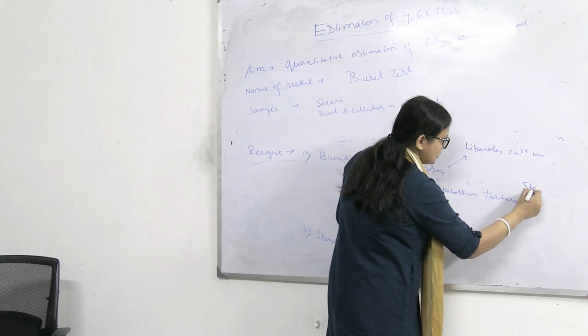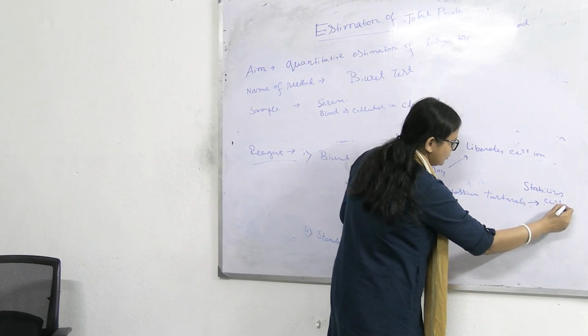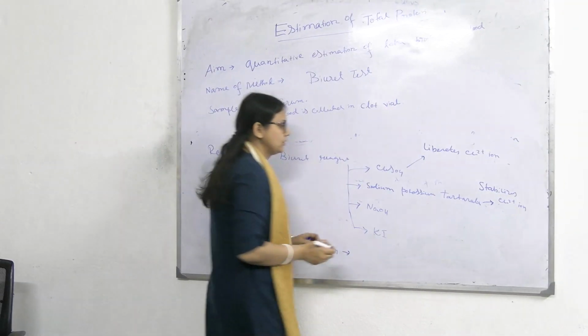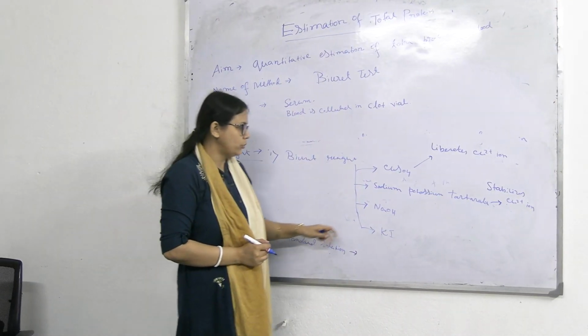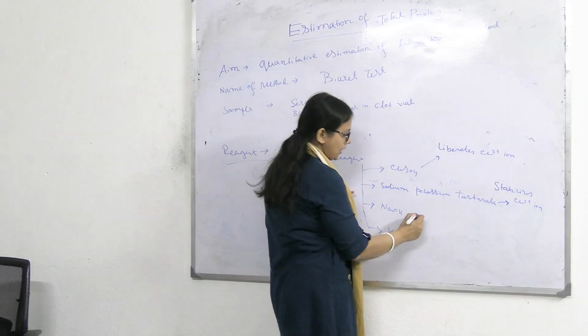It stabilizes Cu2 plus ion. What is the role of NaOH? It provides alkaline medium.